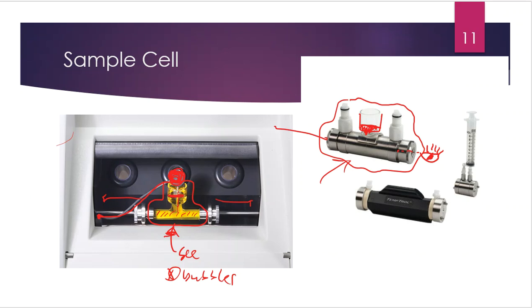And if you can clearly see out the other end, then that means that you probably do not have any air bubbles, and the sample can be placed inside the machine and we can run it. But if you look through those sample compartments and it's just black and you can't see through them at all, there's no image, it's like looking into a really dark closet with all the doors and the lights shut, then it's not loaded the proper way. You probably have a bubble or something preventing the light coming through. So if you cannot see through it, the instrument cannot see through it, and if the instrument and you cannot see through it, you can't make measurements. All right, that's as simple as it is.